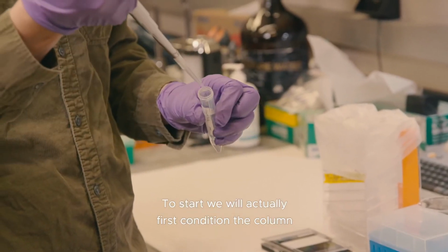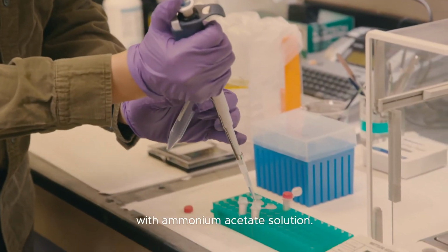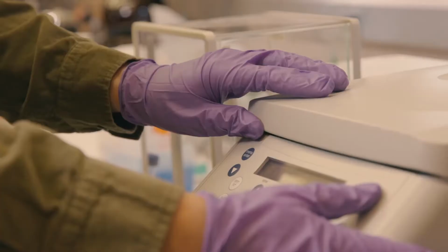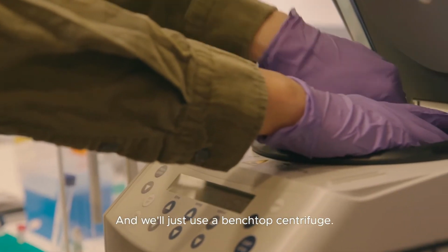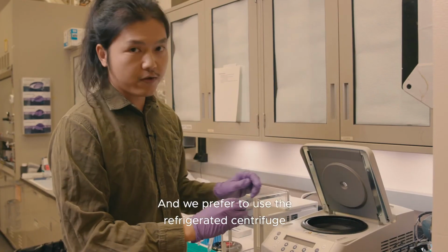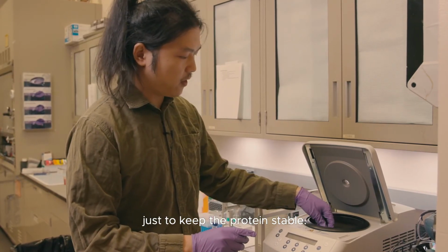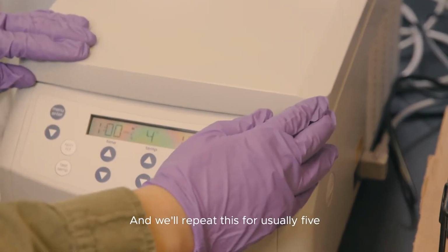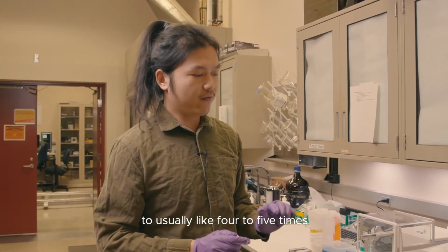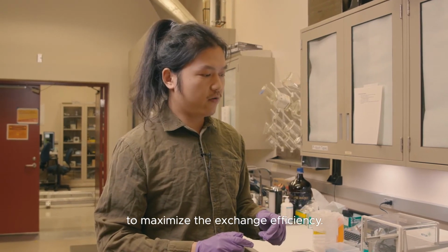To start, we first condition the column with ammonium acetate solution, and we just use a benchtop centrifuge. We prefer to use a refrigerated centrifuge just to keep the protein stable. We usually repeat this 4 to 5 times to maximize the exchange efficiency.